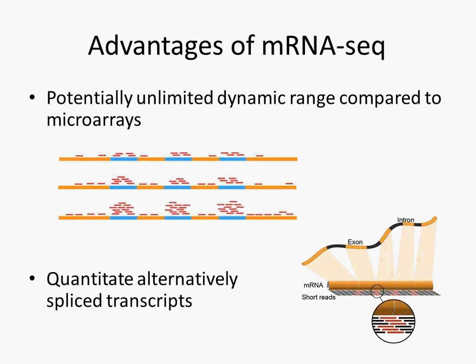The second advantage of mRNA-seq is the ability to quantitate alternatively spliced transcripts.